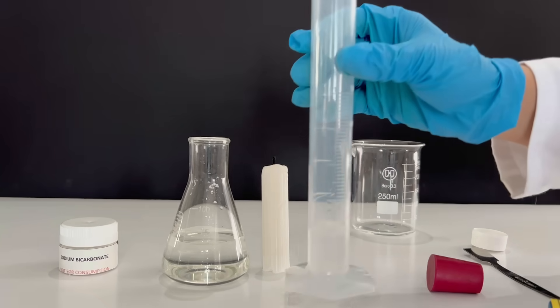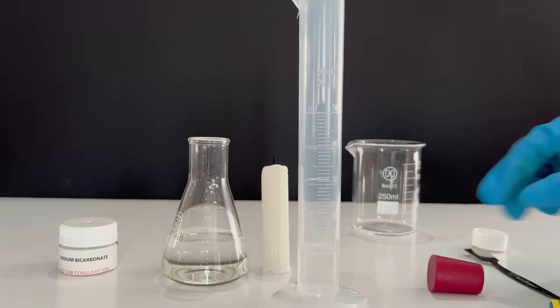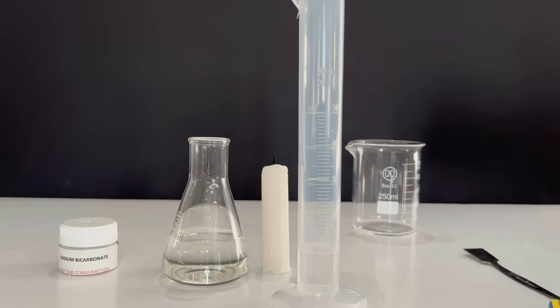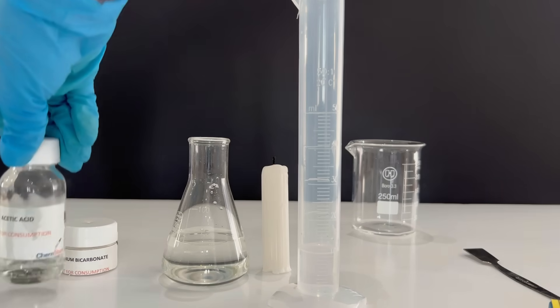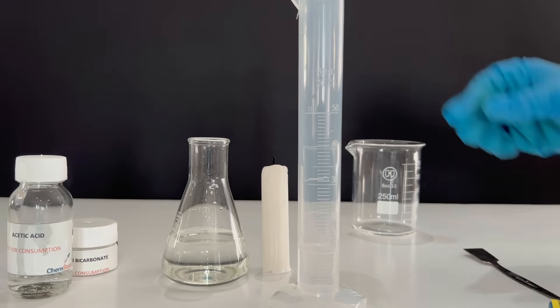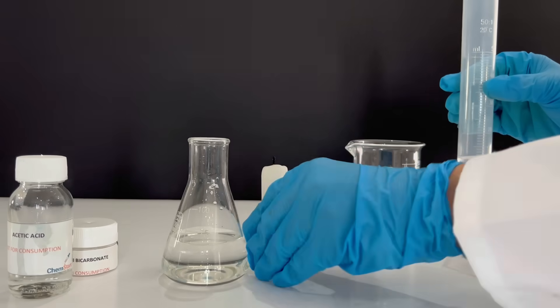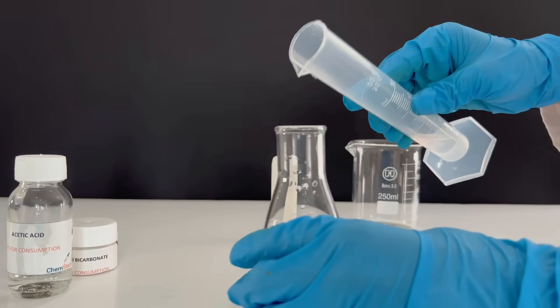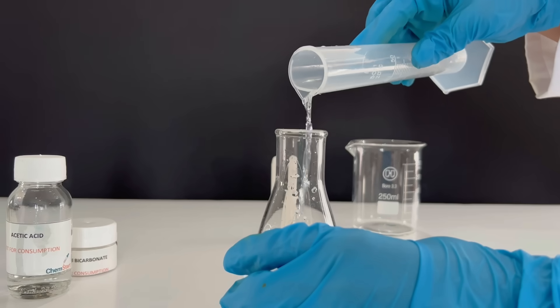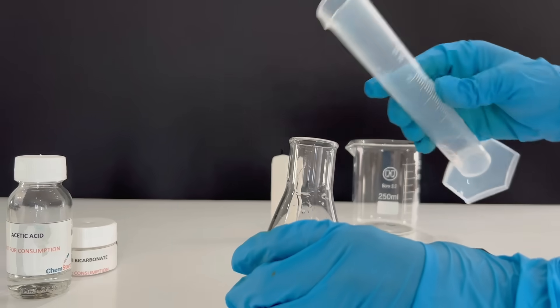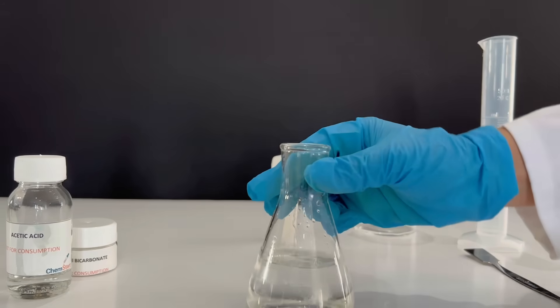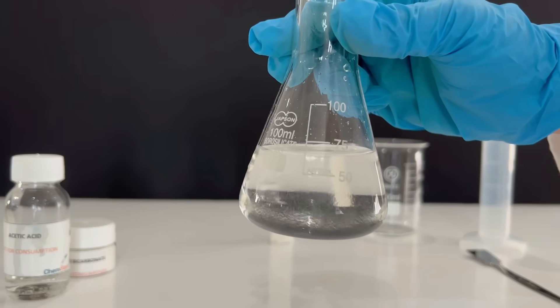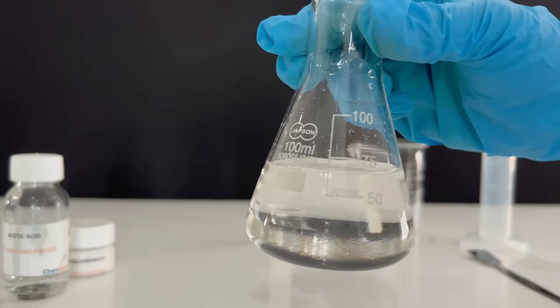Now that we have 10 milliliters measured out in our measuring cylinder, we can add it to the Erlenmeyer flask that is filled with water. Take note of the reaction happening. Do you see? You can see that it's reacting.